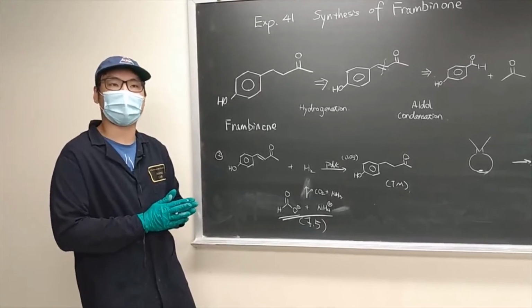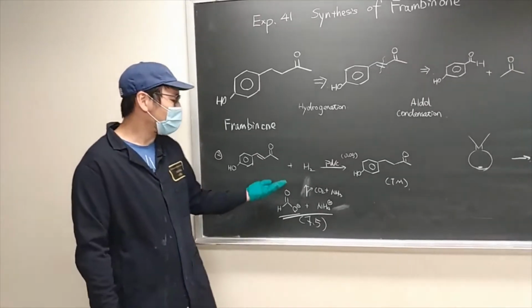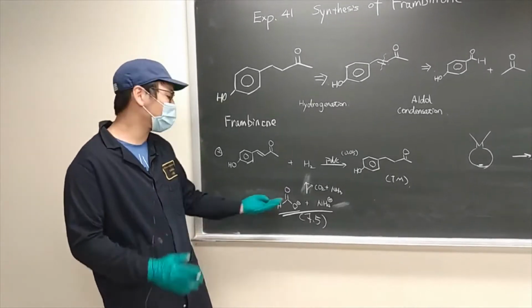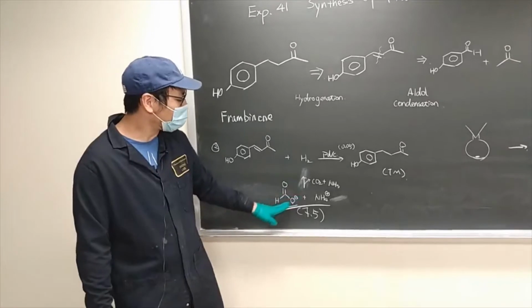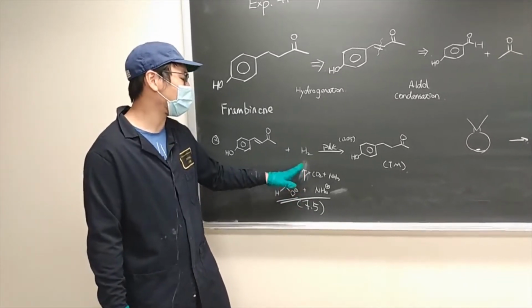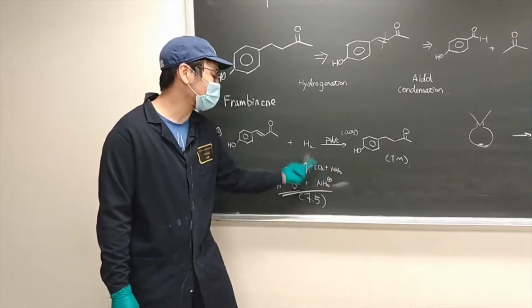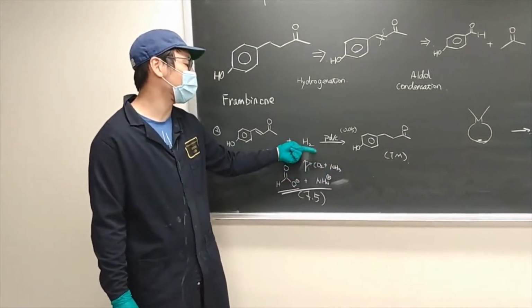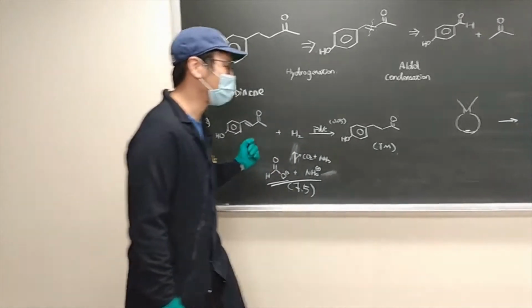So we will find an alternative hydrogen source which is safe to use in the lab, which is the ammonium formate. With the ammonium formate and the palladium catalyst, that will produce three gases at the same time, and one of them is hydrogen gas. So that will be used as a hydrogen source, and that's how we're going to do it.